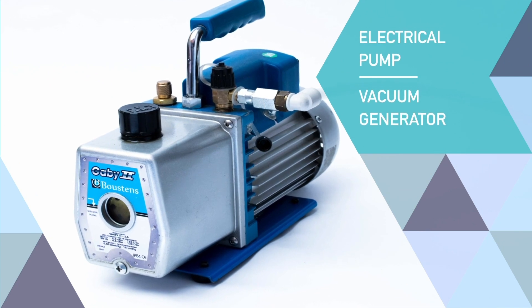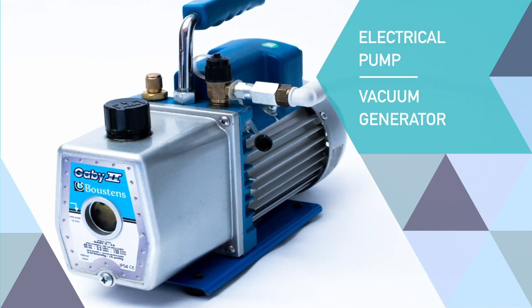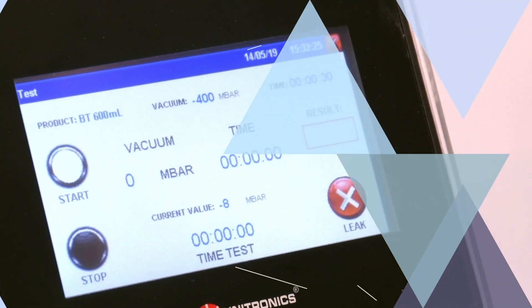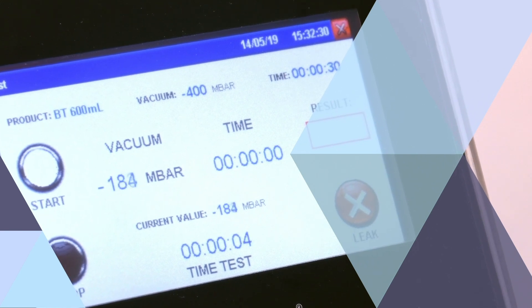The CDV can also be equipped with an electrical pump vacuum generator upon request. A large touchscreen panel makes for easy and user-friendly operation of the CDV.